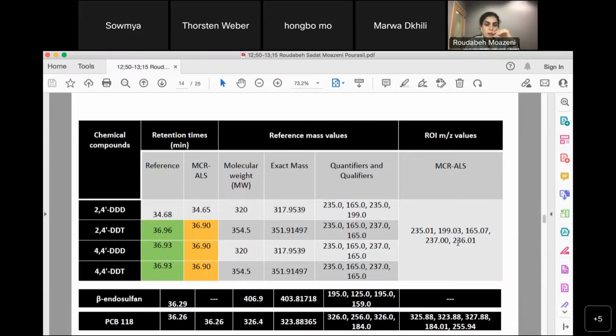One of the resolved elution profiles by MCR has 2 peaks but corresponds to 4 chemical compounds, because the retention times of 3 of the chemical compounds were very close to each other, and MCR resolved just 1 broadened peak for them.